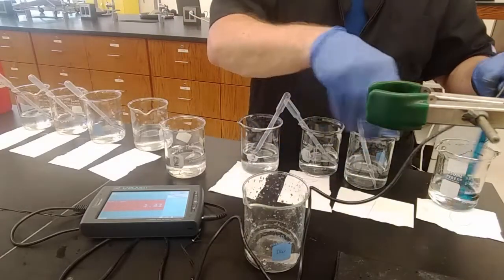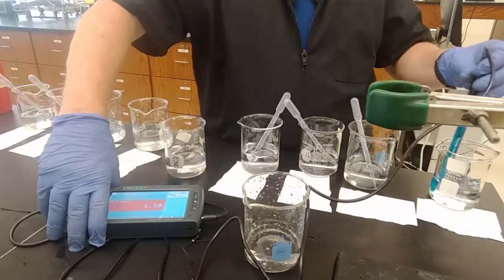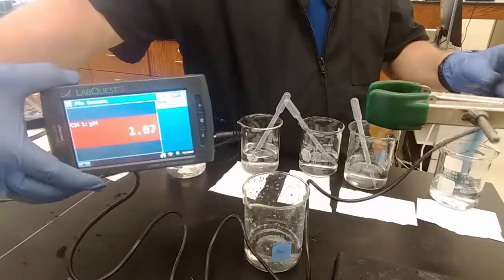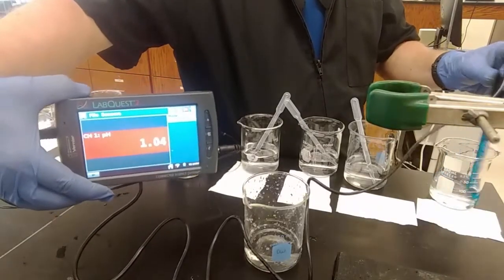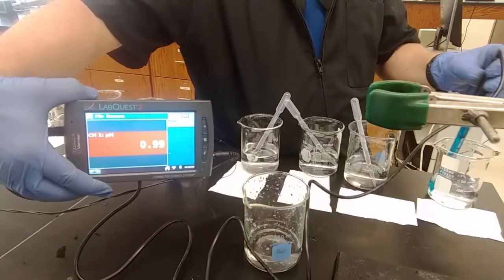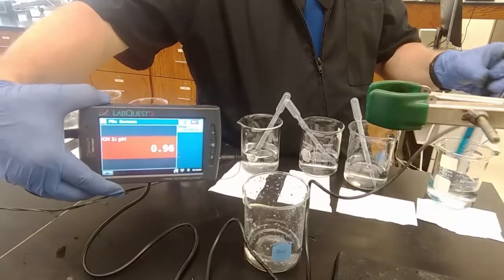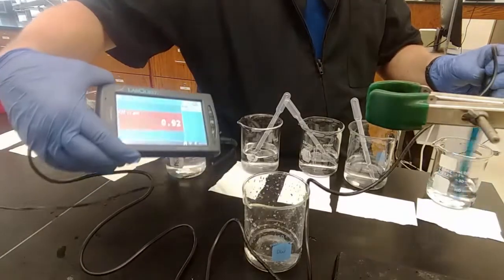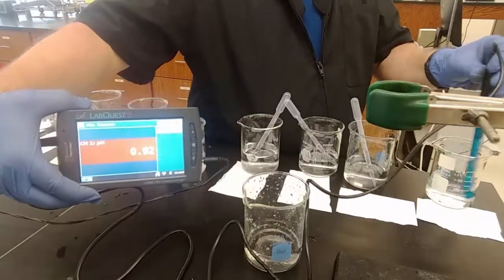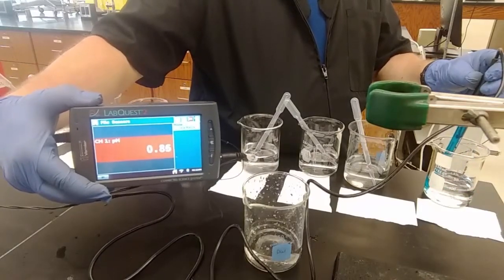pH 0, we're thinking. This is our original 1 molar acid solution. I do not know how long it's been in the stockroom, but it looks pretty fresh. It's not pH 0. It has seemingly neutralized a bit, but again, we'll measure it different ways. Oh, we're getting down there. Let's leave it for another few seconds and see what we get. 0.83. We were expecting pH 0. Not so bad.